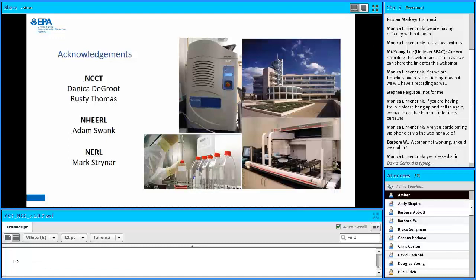And the answer is not going to be a satisfactory one. It's just that lipofectamine is something you can pipette in, doesn't really require any special equipment. And so I don't have any electroporation equipment in the laboratory. And so we started with this. It seemed to work. But it's not to say that electroporation might not be just as effective. We just haven't tested it.